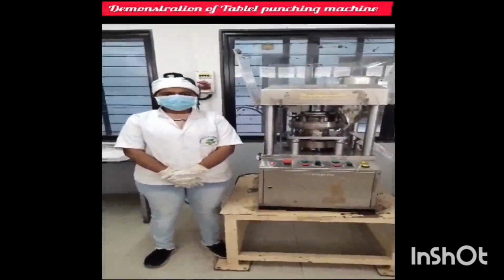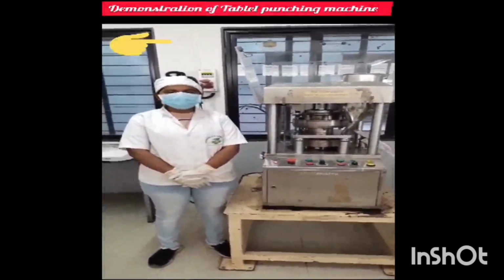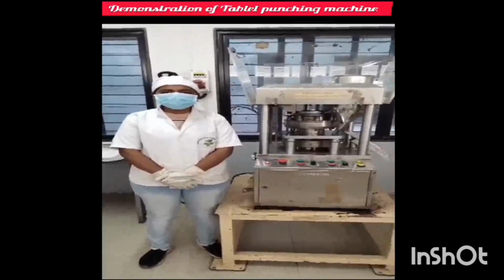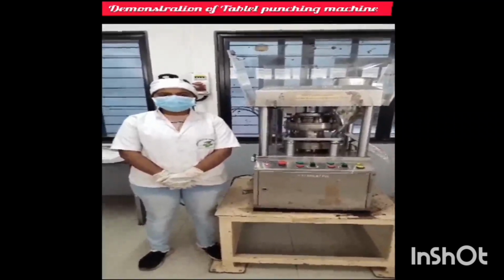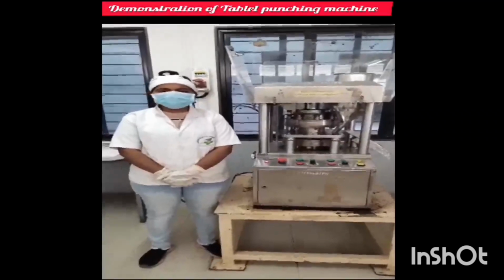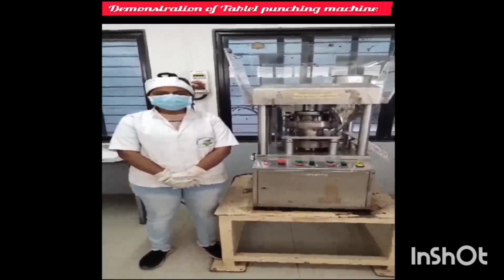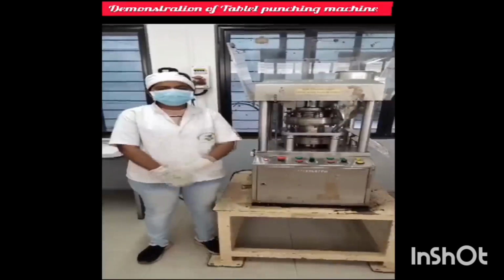Today we are here to see how the tablet is punched with the help of the tablet punching machine by the method of compression. As we have already seen how the granules are prepared and dried with the help of the rapid mixer granulator and tray dryer, now we will see how these granules or powder are compressed and transformed into the tablet, a unique dosage form. The machine that we are going to use here is the 8-station tablet punching machine.